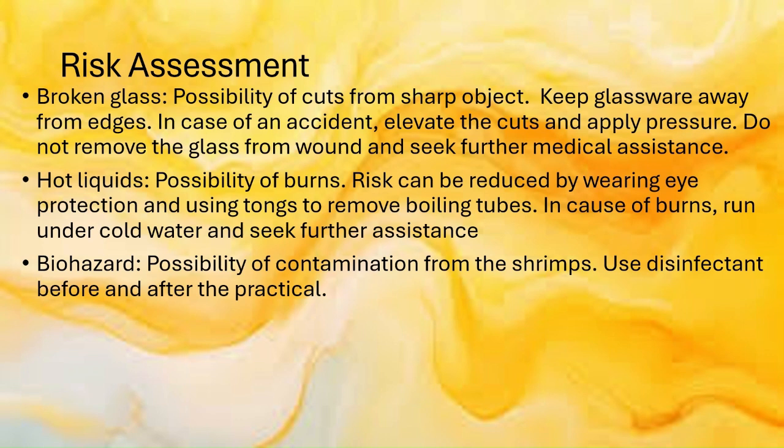There is also the risk of hot liquids because you are dealing with a range of temperatures. So there's the possibility of burns. So risk can be reduced by wearing eye protection and using tongs to remove boiling tubes. In case of burns, run under cold water and seek further assistance. And finally, you have biohazard, which is the possibility of contamination from the shrimps. So use disinfectant before and after the practical.